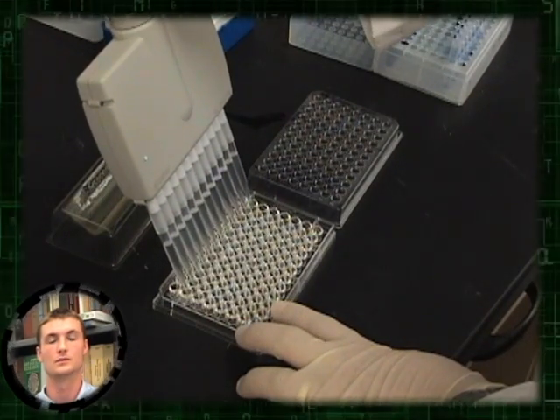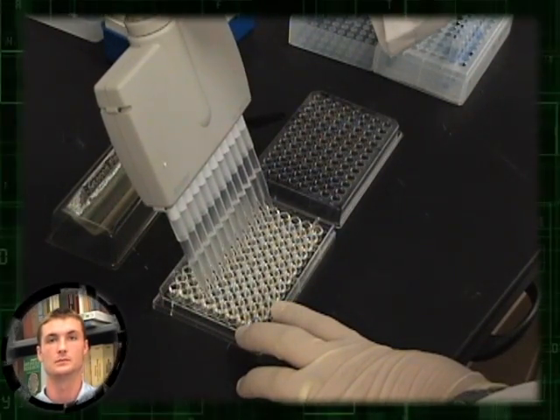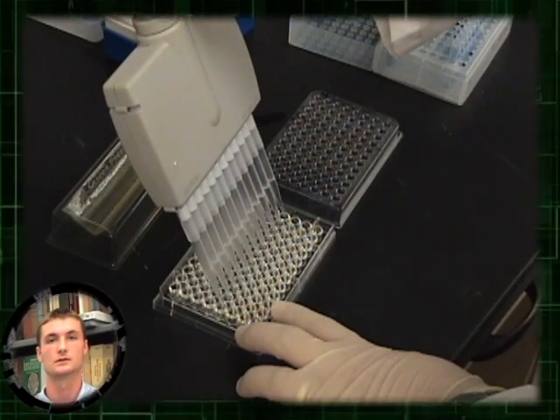The DNA is then resuspended in a water-based solution containing buffer, salts, and chemicals to protect the DNA.